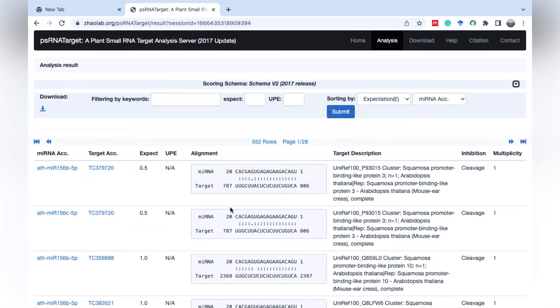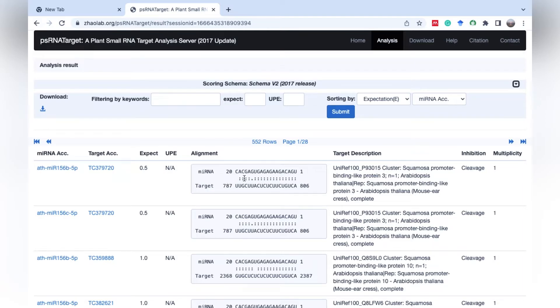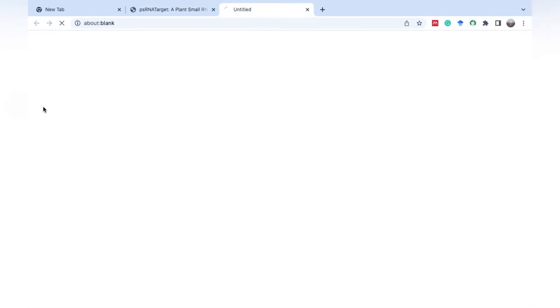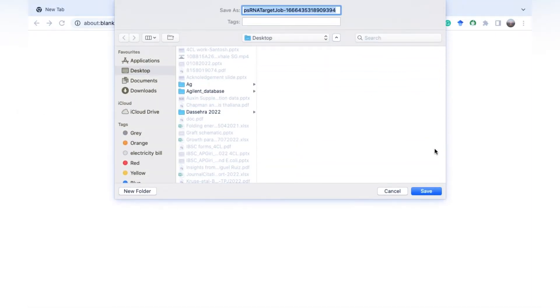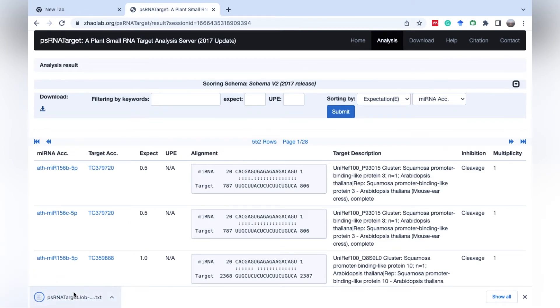Now we have results. As you can see, this column shows the microRNAs which we have submitted, and these are the targets of this microRNA. This column shows the alignment of our miRNA with the target gene. As you can see, there is matching of this miRNA in this target gene from nucleotide number 787 to 806. We can download this data from here. This data is downloaded in the format of text file.